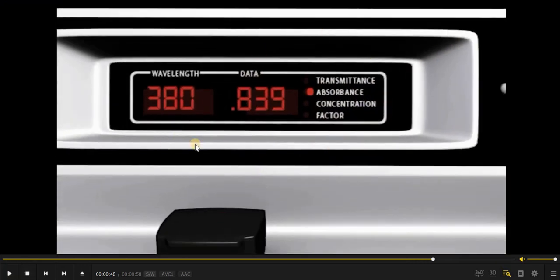And then this is recorded with the help of the detector. The function of the detector is to convert the light radiation energy coming from the sample cell into an electric signal. Common photodetectors are the photocell and photomultiplier tube. Inside the detector there is an amplifier as well. The alternating current generated in the photocell is transferred to the amplifier. Generally the current generated in the photocell is of very low intensity. So the main purpose of the amplifier is to amplify the signal many times so we can get a clear and recordable signal.